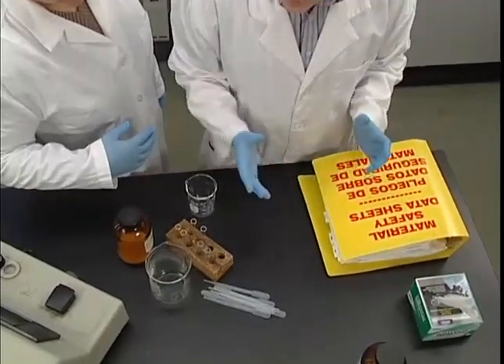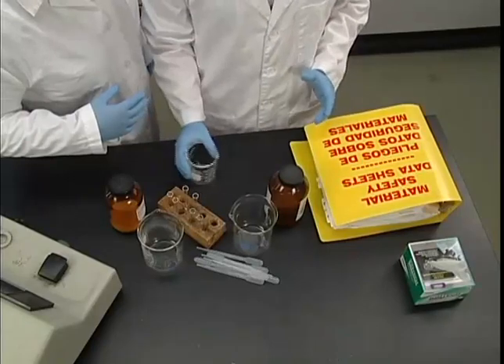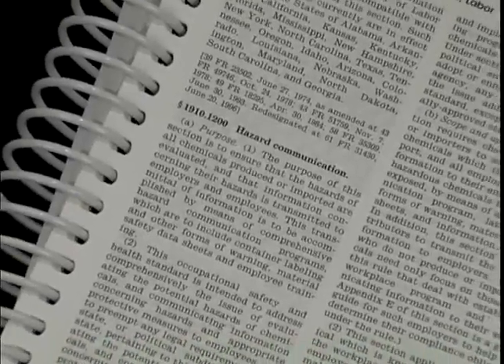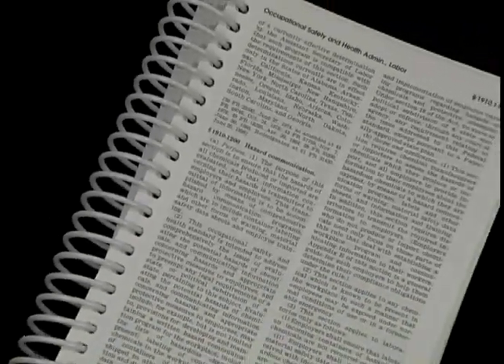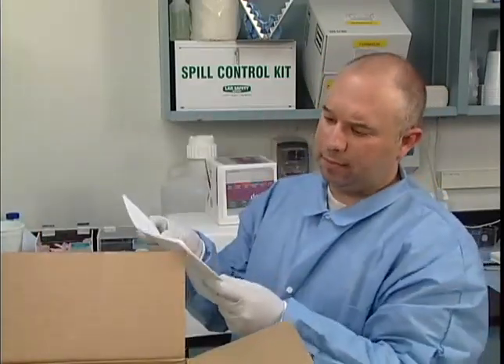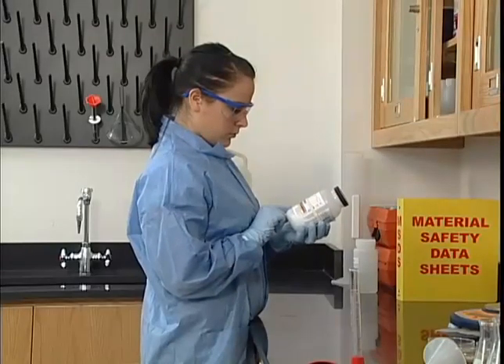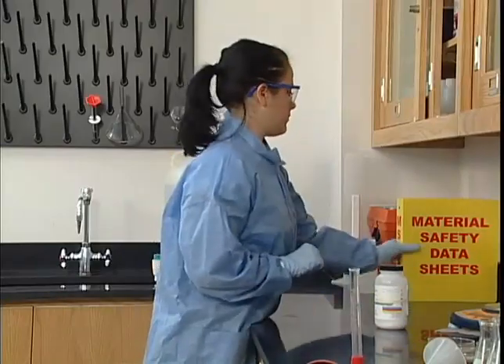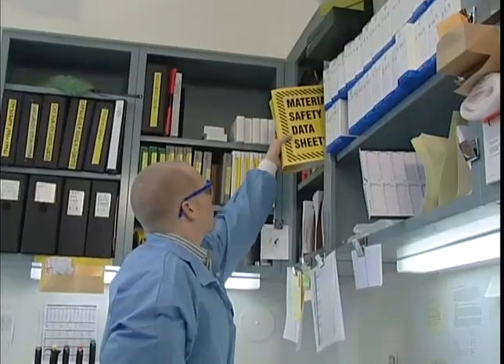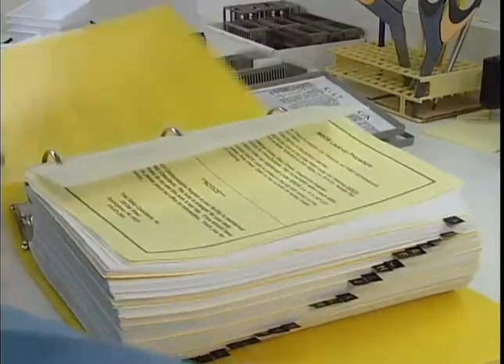For years, Material Safety Data Sheets, MSDSs, provided us with the answers to these questions. MSDSs came about as part of OSHA's Hazard Communication Standard. This right-to-know regulation required chemical manufacturers and importers to give their customers MSDSs for any potentially hazardous products that they supplied. But although certain types of information had to be included, OSHA did not require a standard format for material safety data sheets. As a result, MSDSs ended up in a variety of forms, with data arranged in different ways.